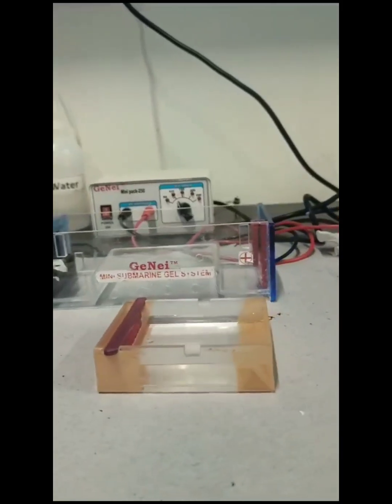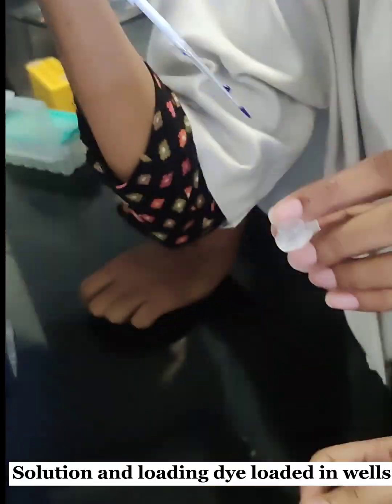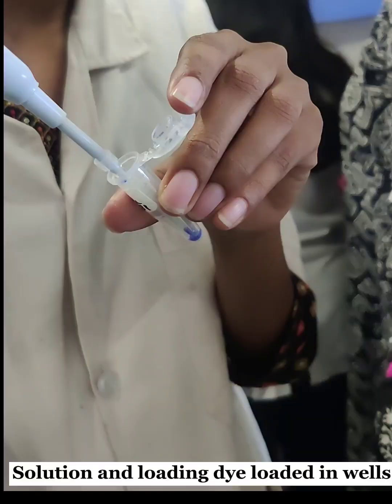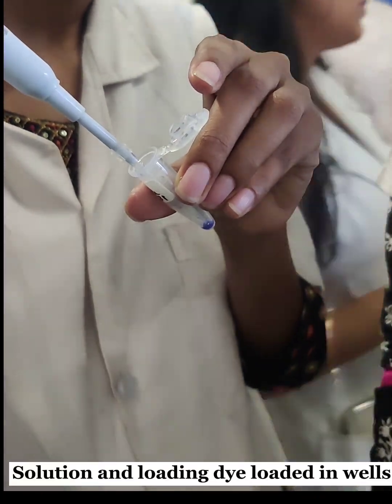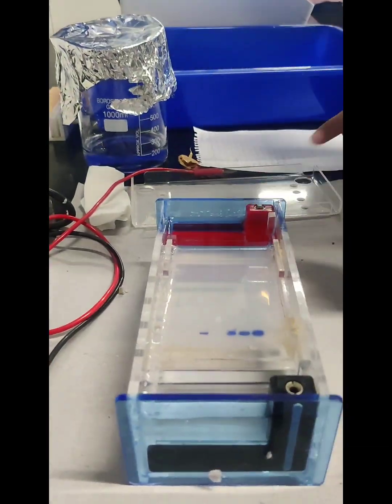The gel was extracted and placed in the electrophoresis casting plate. 20 µl of solution with loading dye was then carefully loaded into the wells. We then observed the gel under the UV transilluminator.